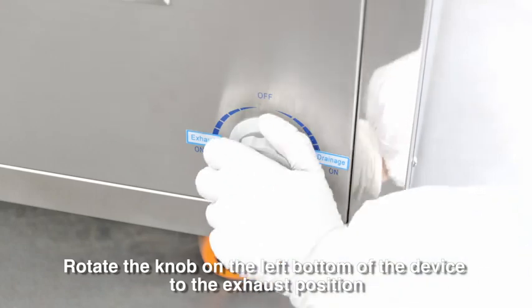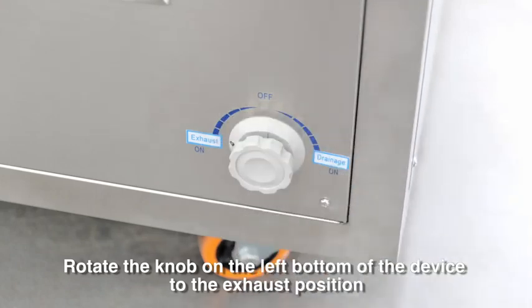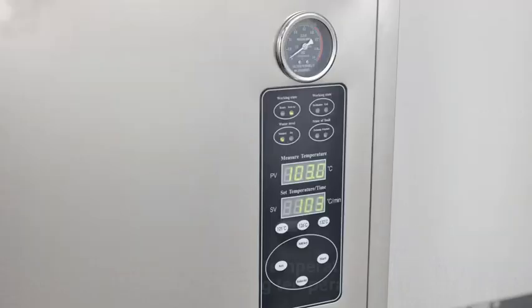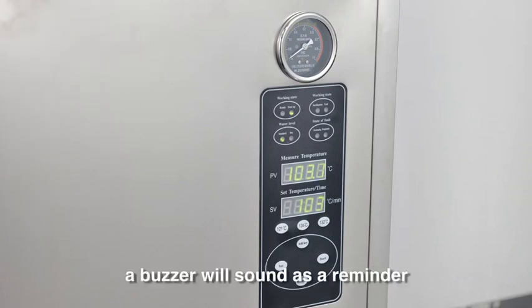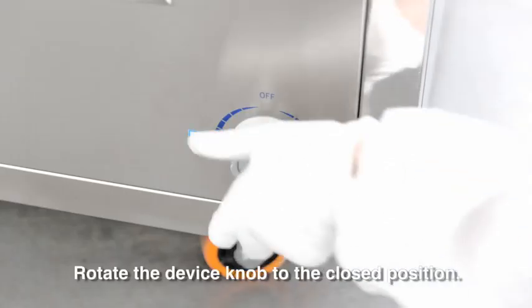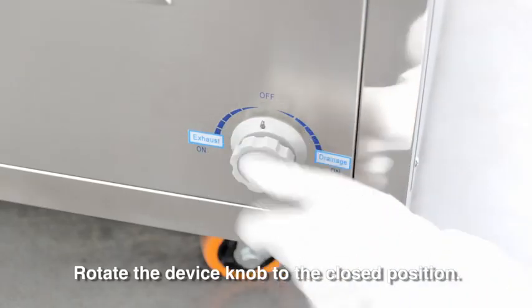Rotate the knob on the left bottom of the device to the exhaust position. When the measured temperature reaches the preheating temperature, a buzzer will sound as a reminder. Rotate the device knob to the closed position.